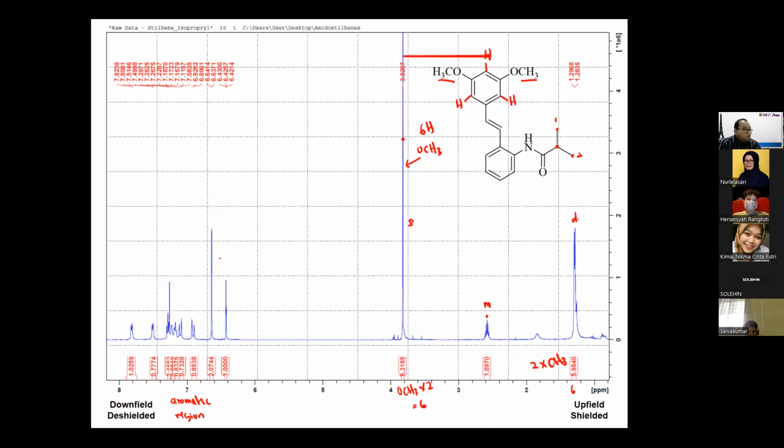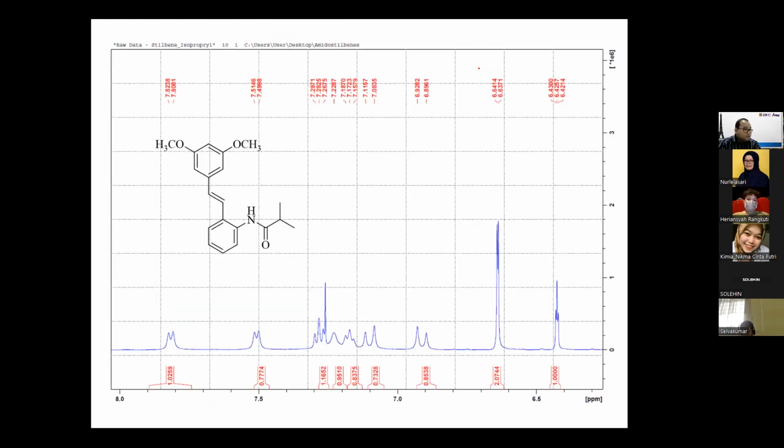Okay, both show, if you run your sample in the lower field, I mean 400 megahertz, you will see only singlets. If you run with 500 or 600 megahertz, there will be doublets because they are meta couplings. The J couplings between meta couplings is around 1.8 to 2.3, for example. Okay, so this information you should keep in your mind. So the rest of what you can analyze here is this one. If you see clearly, this is the very symmetric proton.